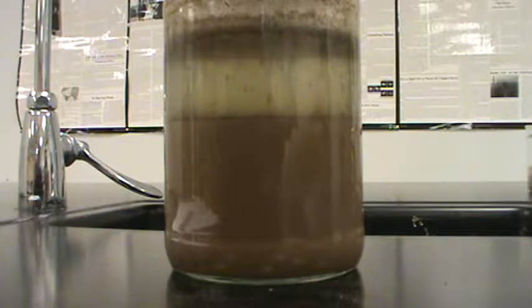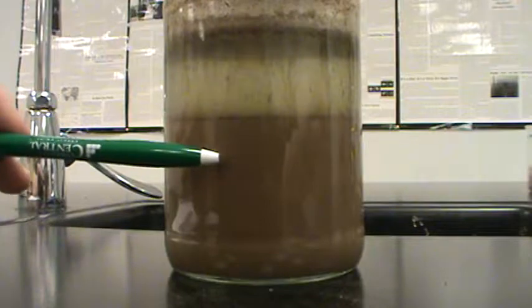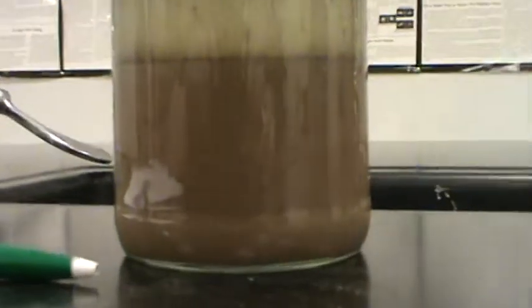And what I'm seeing, as I said here, is from the bottom up to right in this neighborhood, I'm seeing sand particles. I'm going to try and zoom in just a little bit and then let the camera adjust its automatic focus. I believe you should be able to see behind the glass, some of these larger sand particles peeking through. As we pan up, we continue to see the larger sand particles up to right in this neighborhood here. Then it becomes more of our smaller particles, which we would call the silt particles.